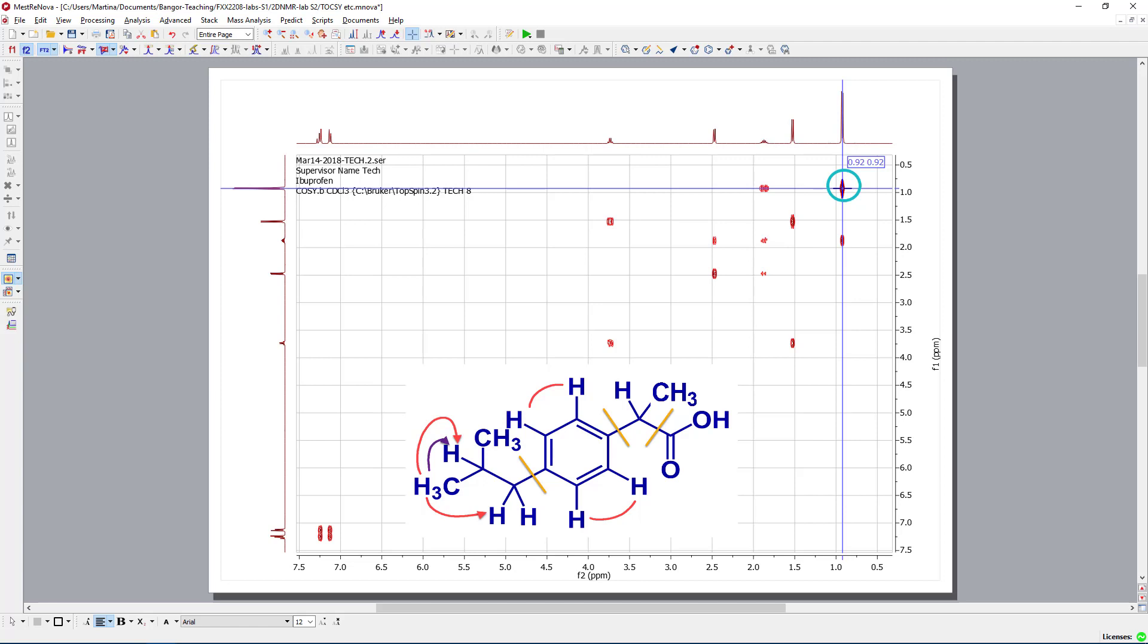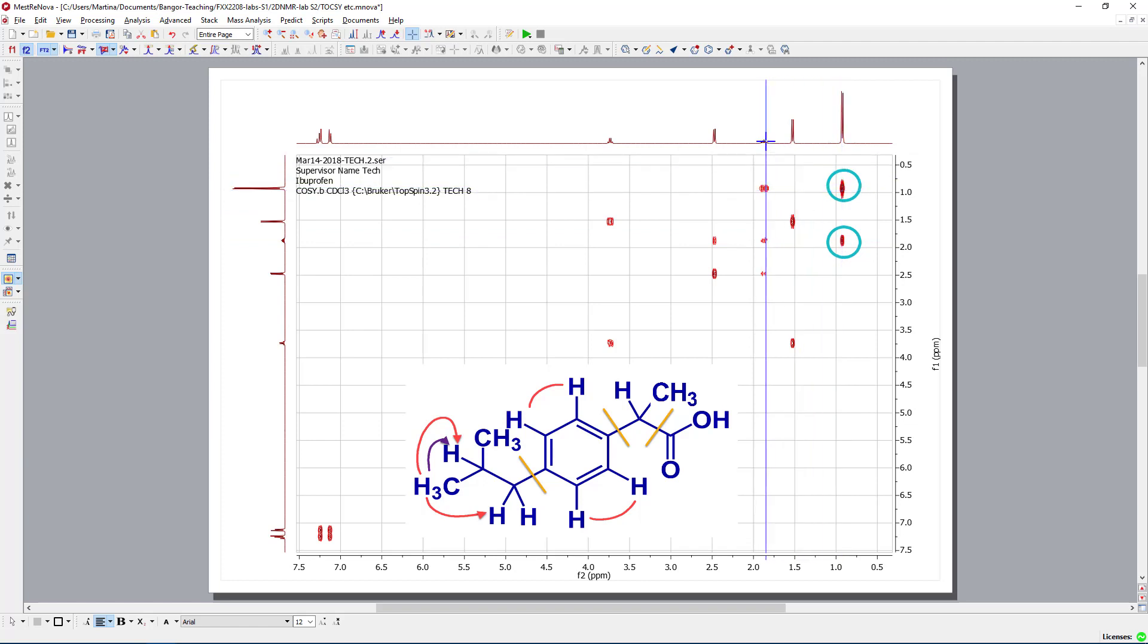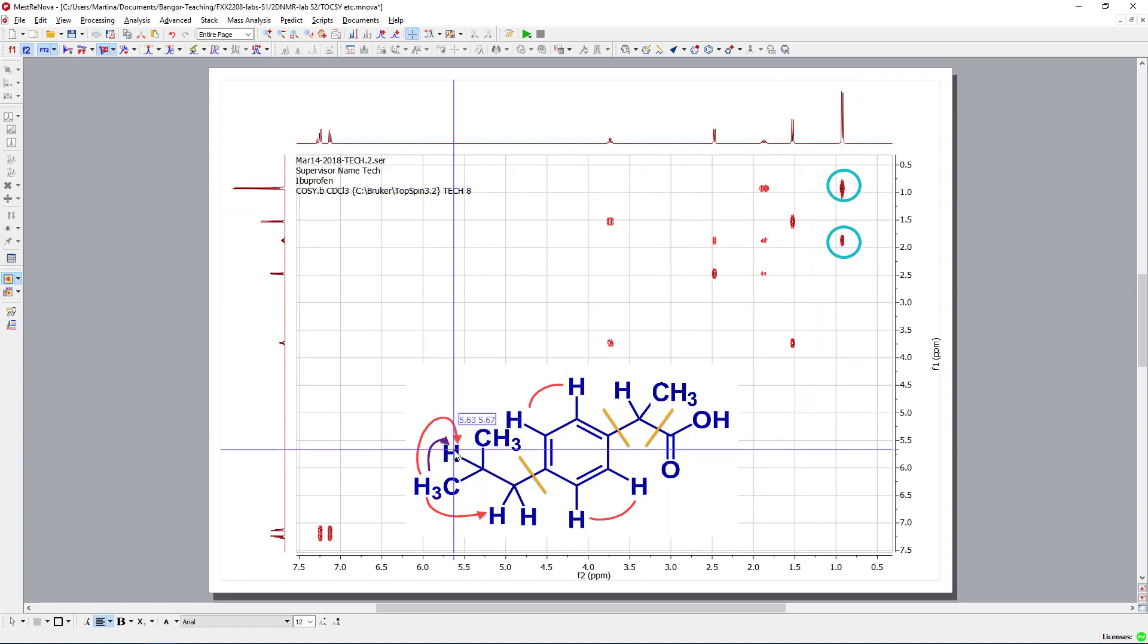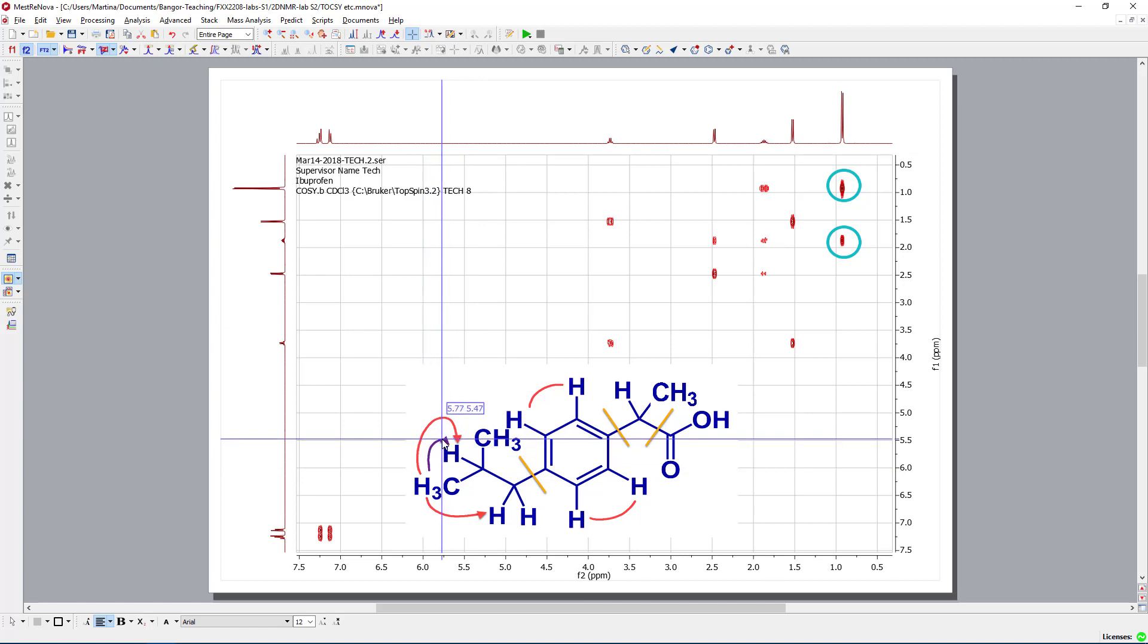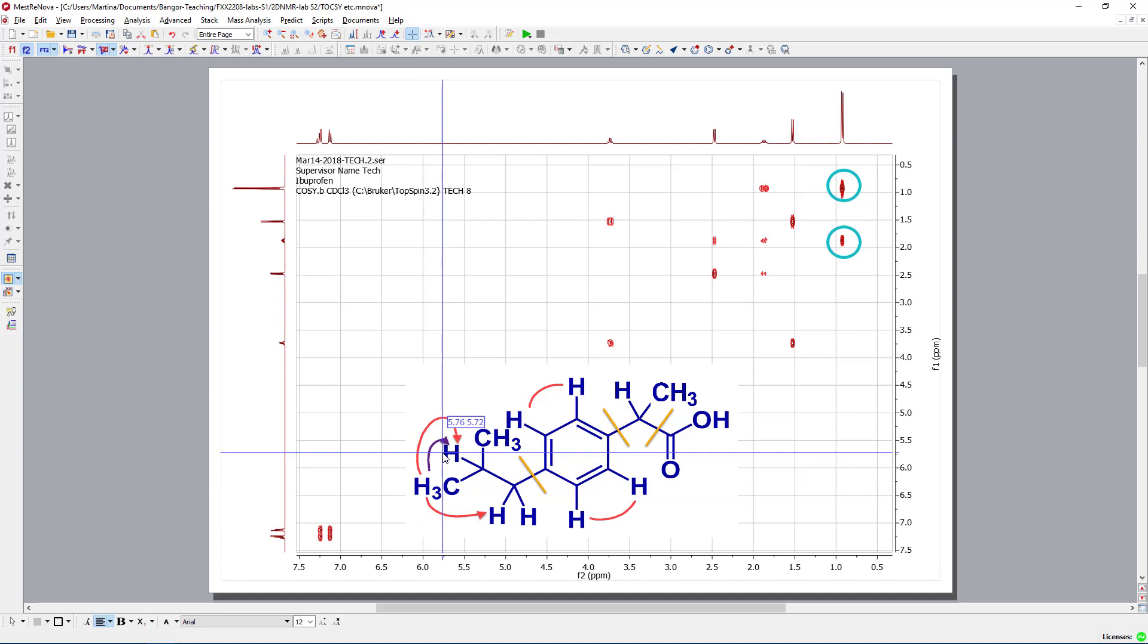That is something we can see here. But then, if we go down or horizontally, then we see there is only one additional peak, which leads us to the CH group. So, this purple line indicates my coupling in the COSY.